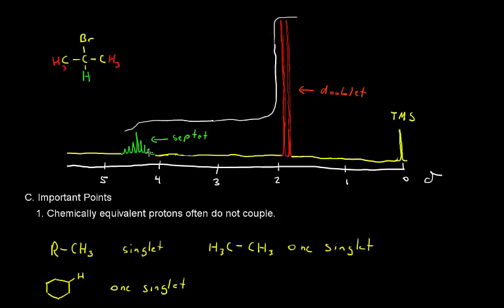But you have to be careful because often when you start getting lots of coupling like this, you start getting multiplets. Notice how the intensity trails off because of the statistics of the possible configurations of the spin states on all these protons. As you get to the edges of the multiplet, you're less likely to have those configurations, and therefore the intensity of those resonances is less.